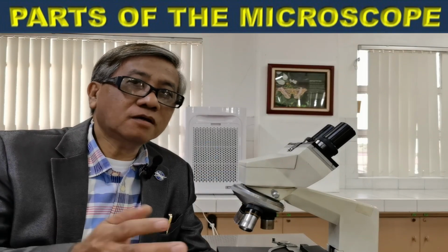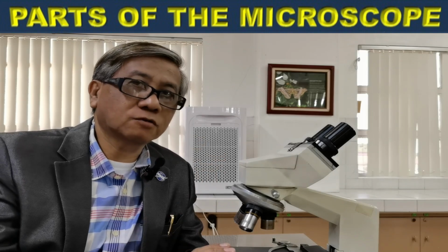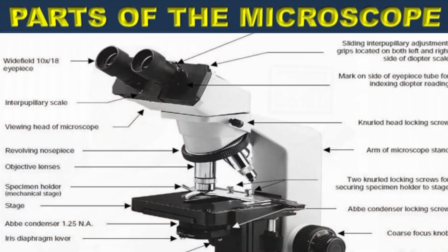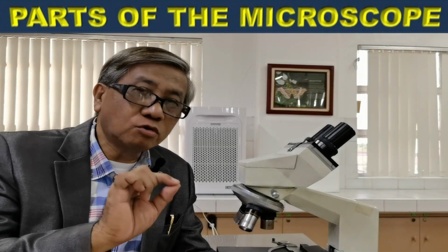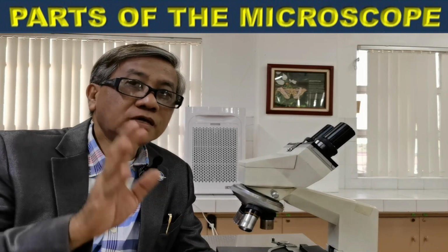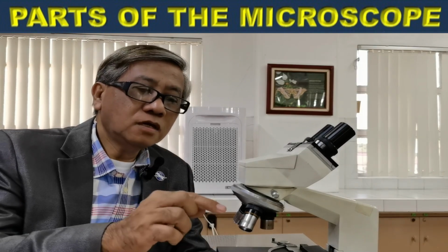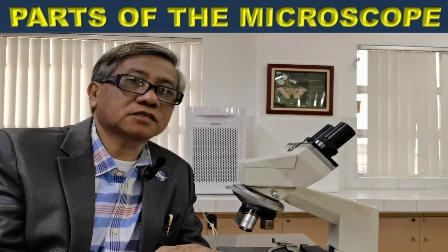Now, optical microscopes like this one are what we call a compound microscope. A compound microscope uses two or more lenses to produce that magnified image of small or minute objects. There are two basic lenses in a compound microscope. We have the objective lens and the ocular or eyepiece lens.